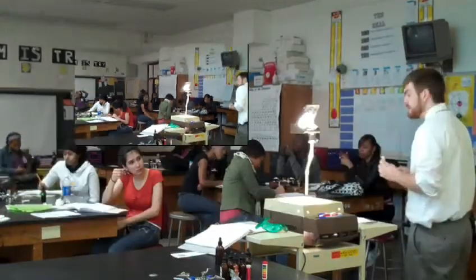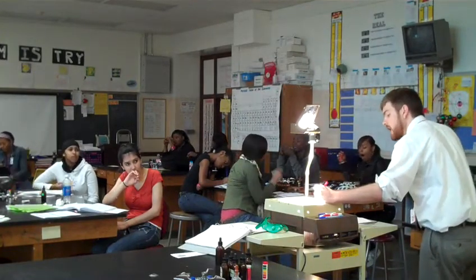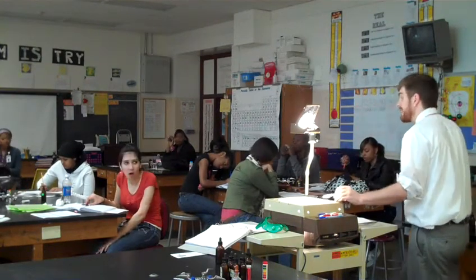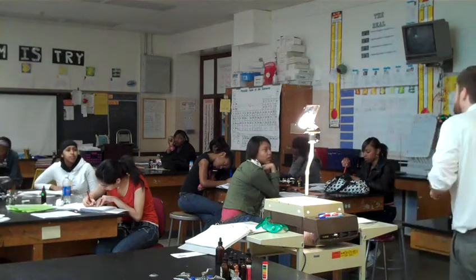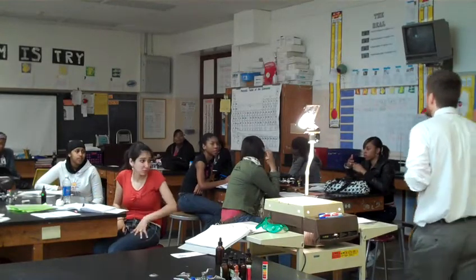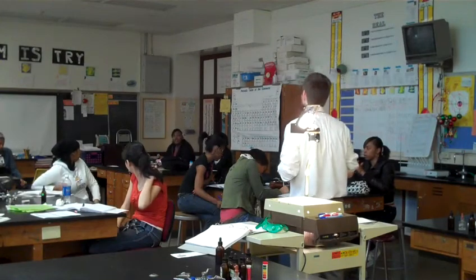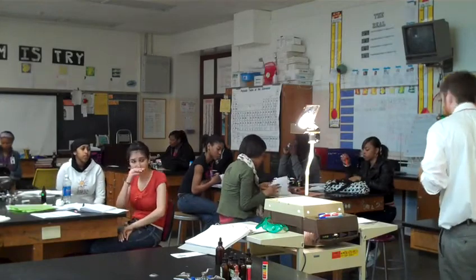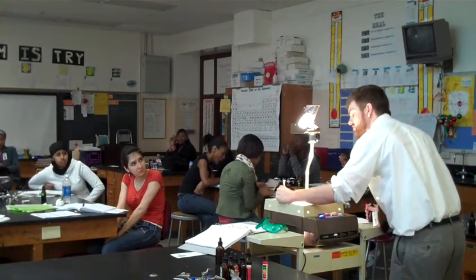The purpose for the lab today is to identify an unknown. Please put that in the fourth column, because you'll put two drops in those three spots. To identify these, we're going to be using indicators. That's your vocab word for today. Crystal, can you read that vocab word, please? A chemical that changes color with pH. So these are chemicals that change color with pH. The first one is phenolphthalein, and you can abbreviate that PHEN.